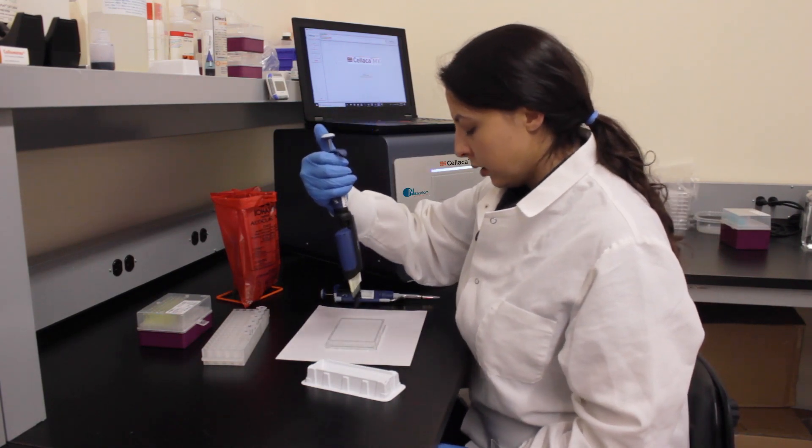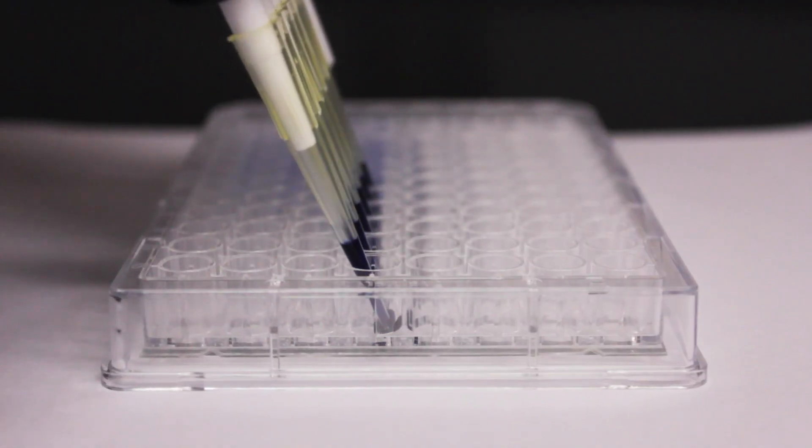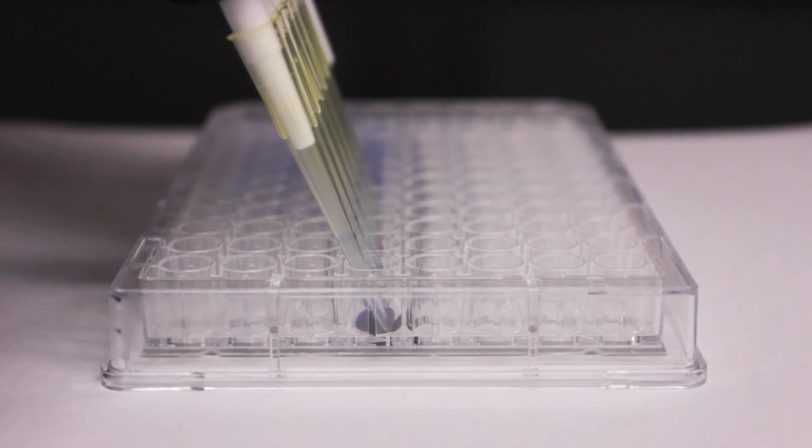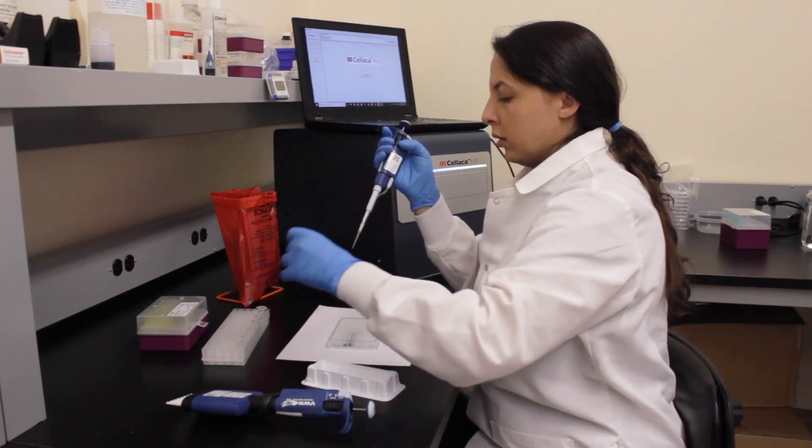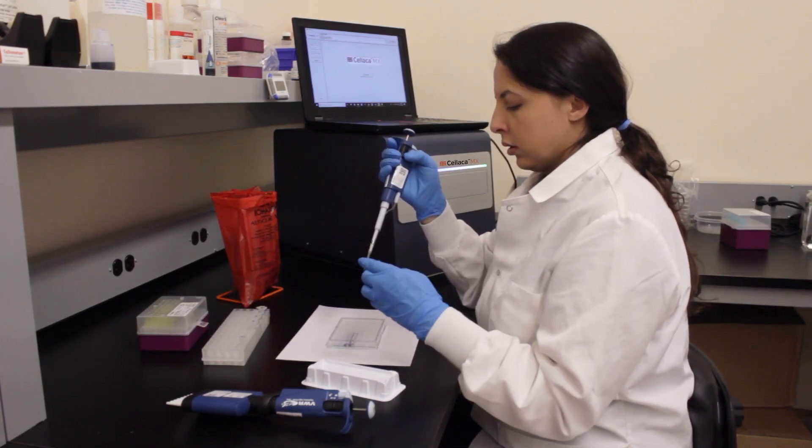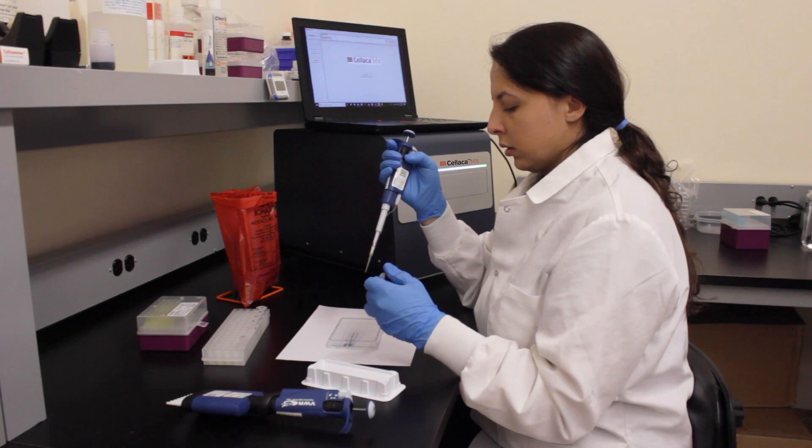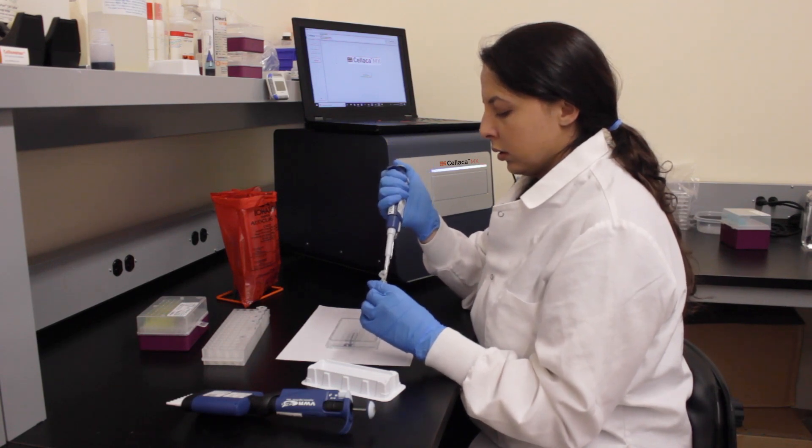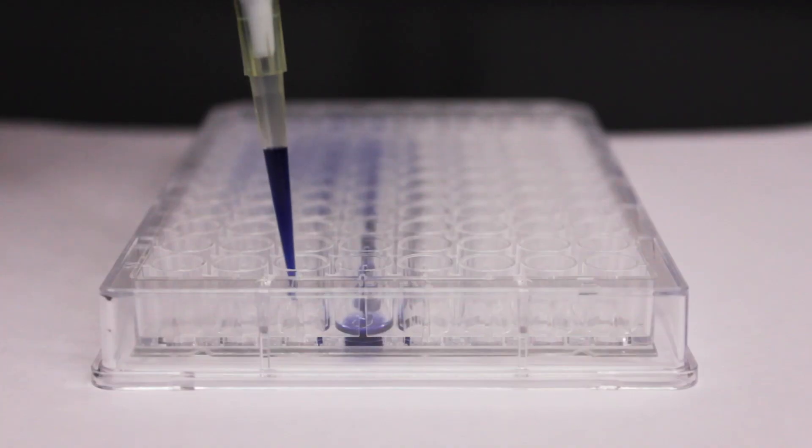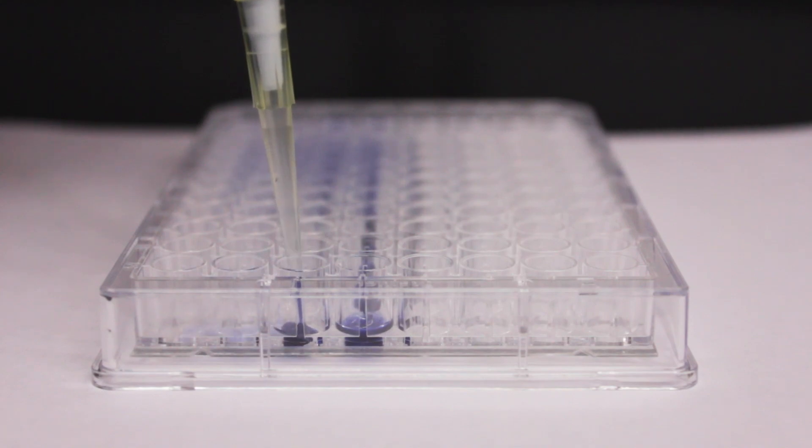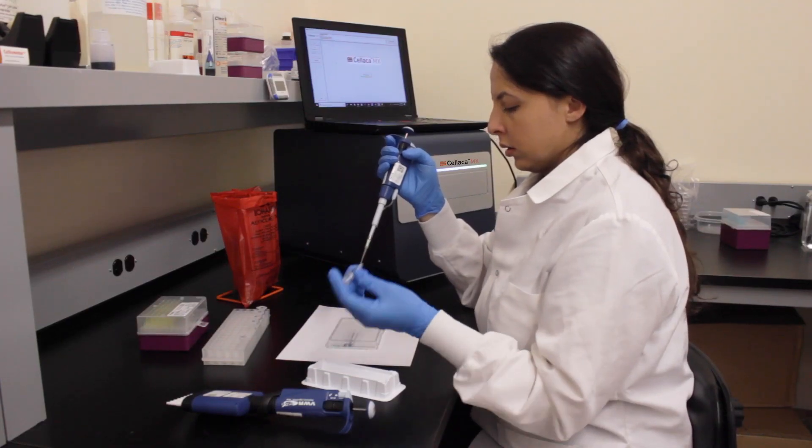First, using the multi-channel pipette, load the Trypan Blue into the mixing chamber. Then load the first cell sample into the mixing well. Mix the sample and pipette it into the loading well. Once the first cell sample is loaded, you can move on to the second cell sample.